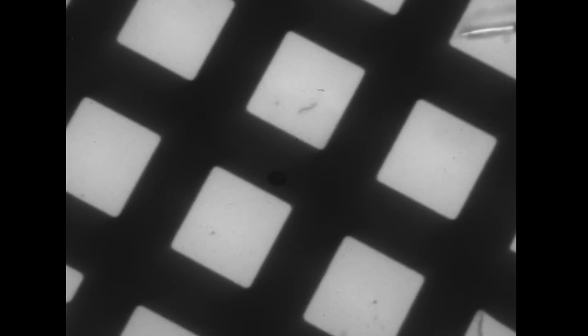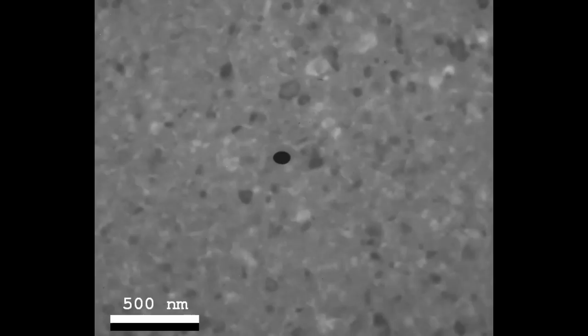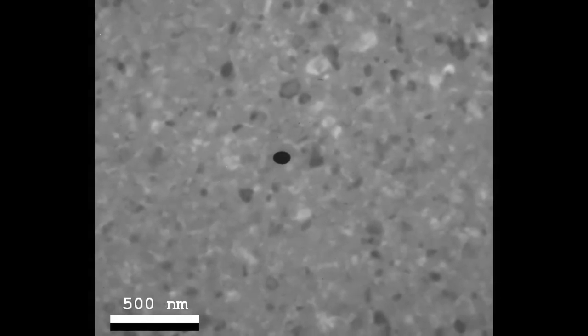So let's start by putting in the sample. As you can see now, I've put you to view the camera image of the microscope — it's dark in the room now. The thing that you see is the TEM grid with the sputtered aluminum on top. So the bright areas here are a thin layer of aluminum that's been coated. You can magnify this and look at just one of these transparent squares. This is how the sputtered aluminum sample looks in the bright field imaging mode of the transmission electron microscope.